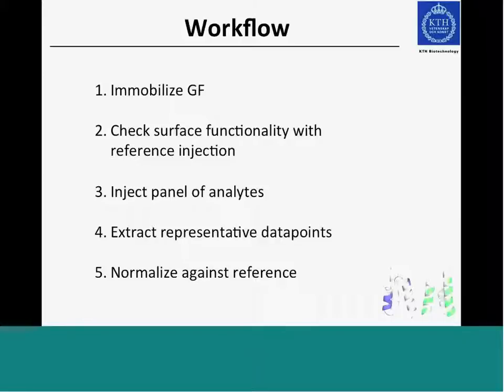So imagine doing 1 analysis, it takes you 1 hour, and if you are effective, you can maybe start several pre-incubations at a time, or with a certain delay, and you can get the data quite easily that way. So then you extract representative data points, and you have to, of course, take the data points at the same time, and you normalize them to reference manually.